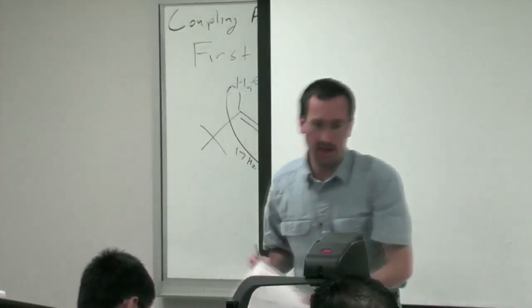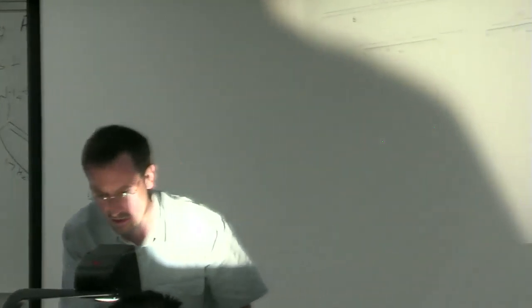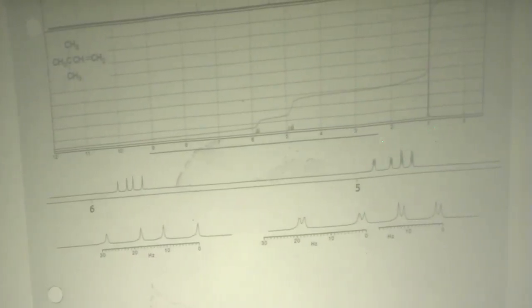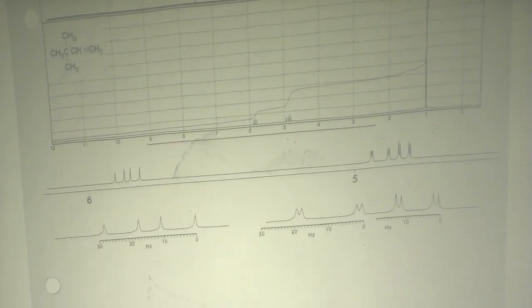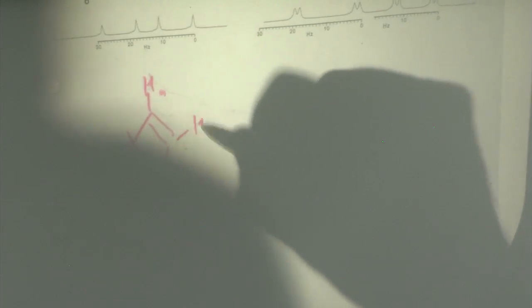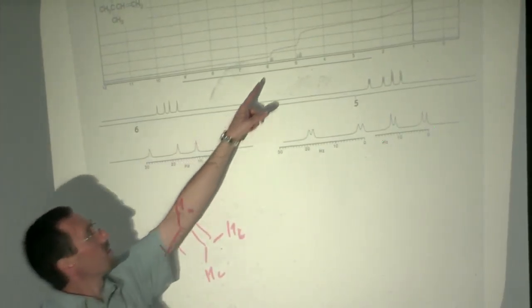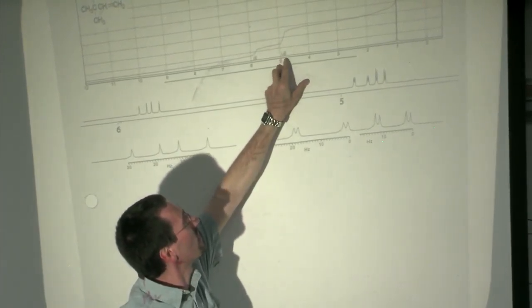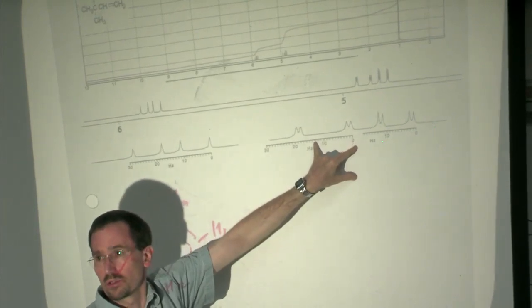So let's take a look. This is a real spectrum of 3,3-dimethyl-1-butene that I pulled out of the SIAL website, and then just using Illustrator, I expanded the multiplets and put them on top of a hertz scale. So, based on this right now, we should very easily be able to see which proton corresponds to which. This multiplet here is expanded over here and further expanded on top of a hertz scale here. These two multiplets here and here are expanded over here and then expanded onto two scales.